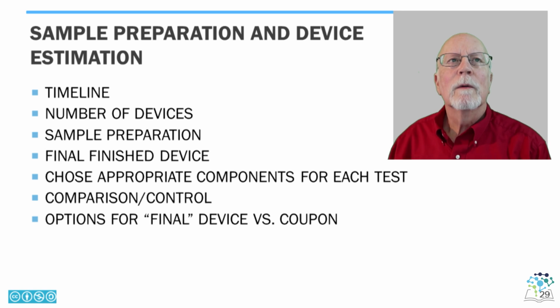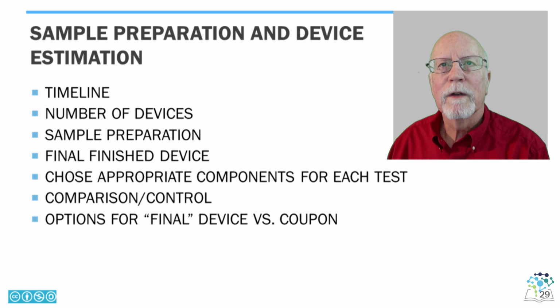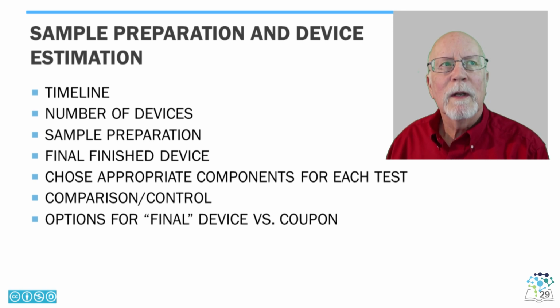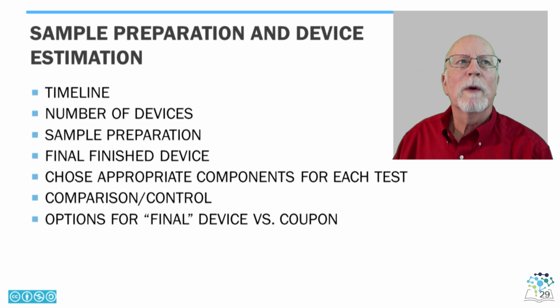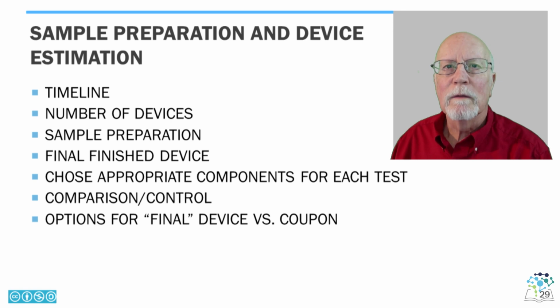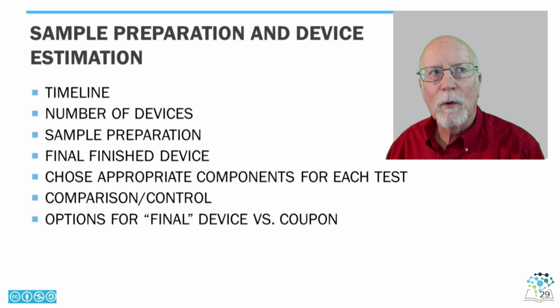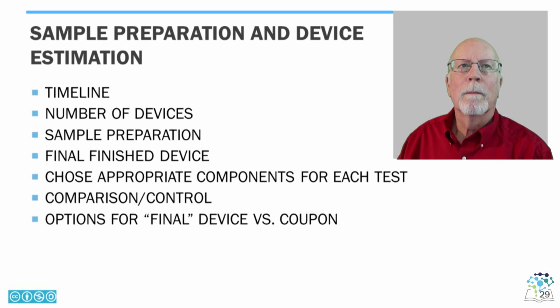Let's digress for a moment and look at exactly how one goes from a device in final finished form in its packaging to testing in a biological assay per these standards. First, except in the case of implantation tests, remember that we're not actually testing the intact devices, but evaluating the performance of an extract of each device in both a polar and a non-polar solvent, typically normal saline or sesame seed oil, in these bioassays.